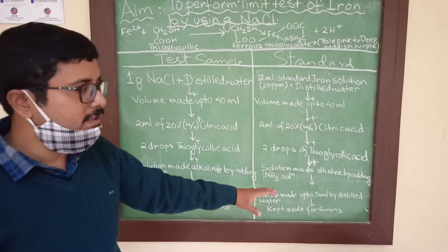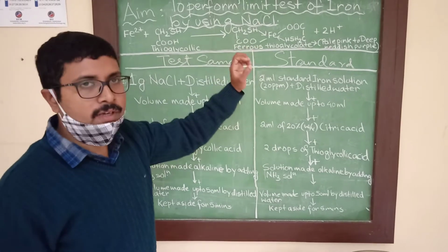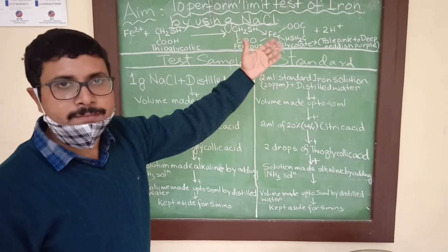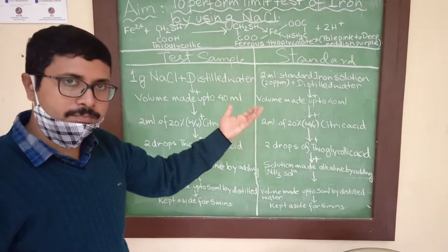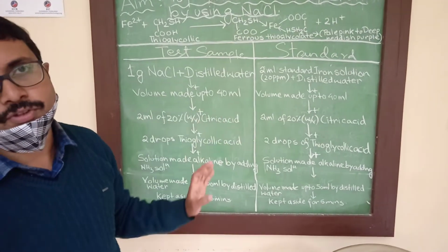So after 5 minutes, the complex of ferrous thioglycolate is formed, which is pale pink to deep reddish in color, and the color of this complex is compared between the test and the standard solution.